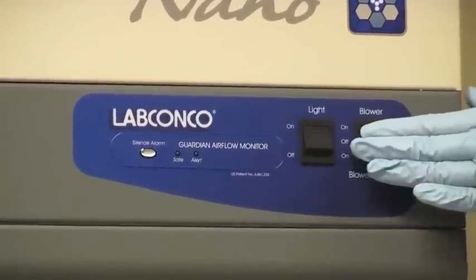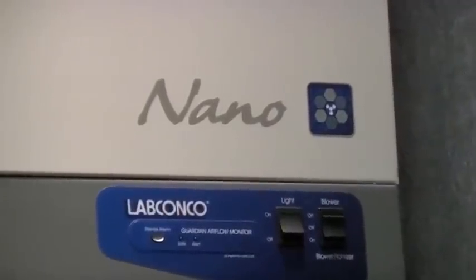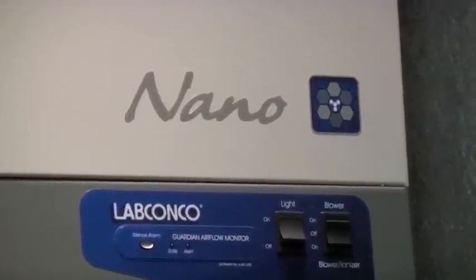Quiet operation as low as 48 to 53 decibels provides a quiet work environment. The built-in airflow monitor alerts the user to face velocities outside of the preset range.